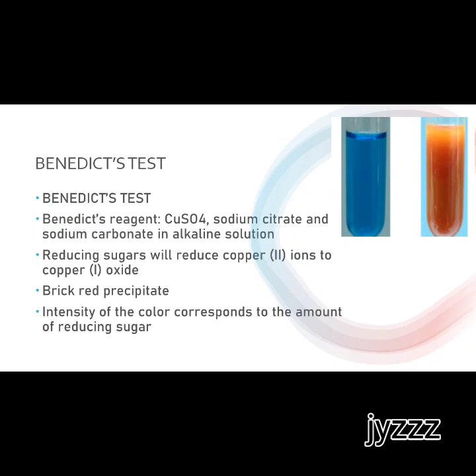Okay, and of course your polysaccharides and your starch will give a negative result for this. That is for your Benedict's test.